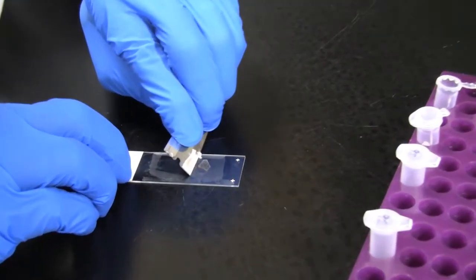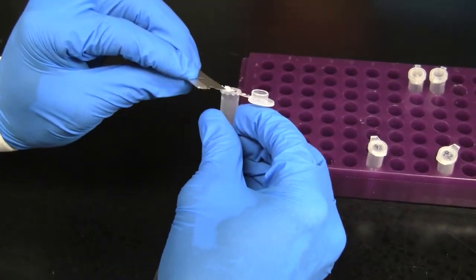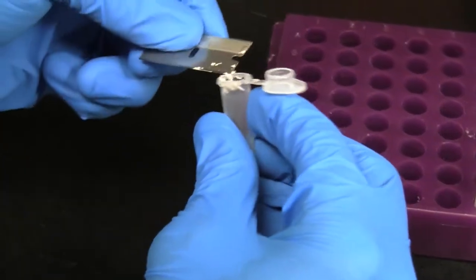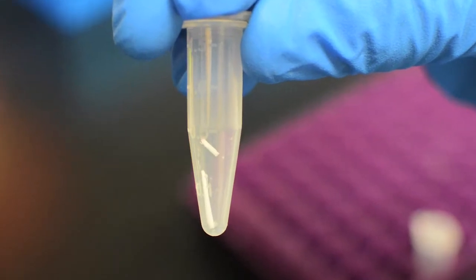If the sample is on a slide, use a clean razor blade to carefully scrape the sample into a 1.5 milliliter tube. If samples are small, several slides can be processed in the same tube. Curls are already in the tube.